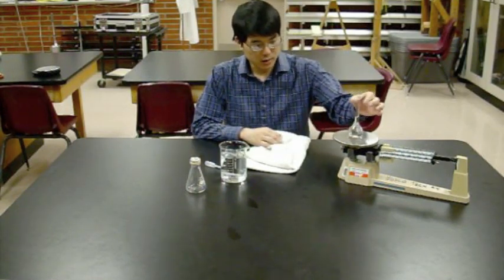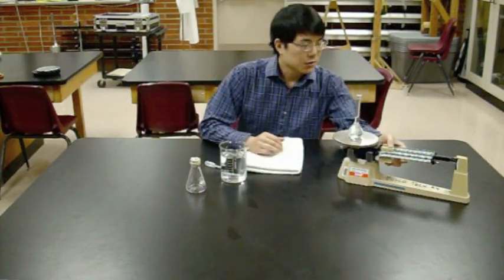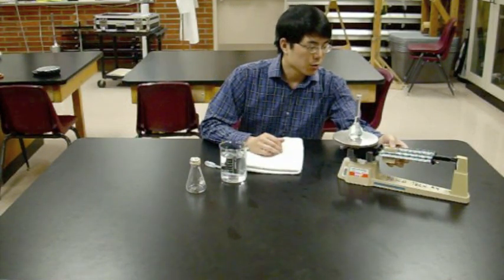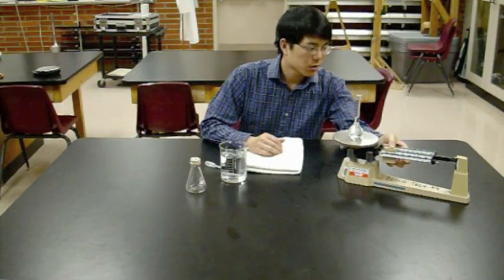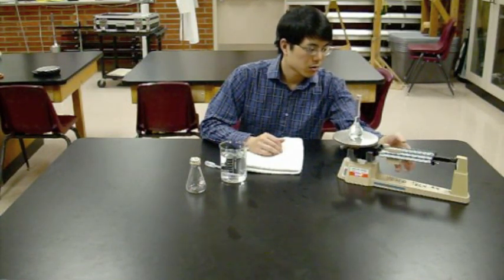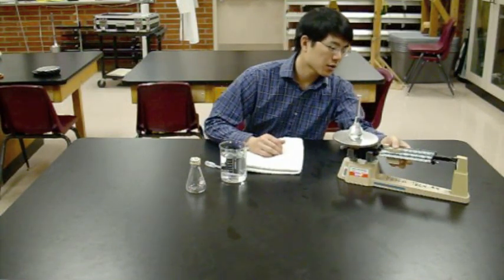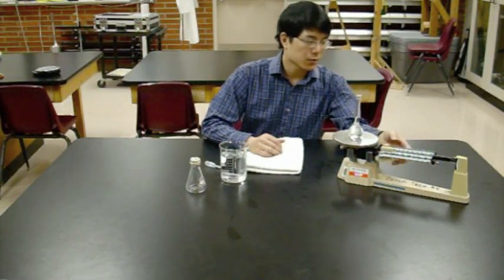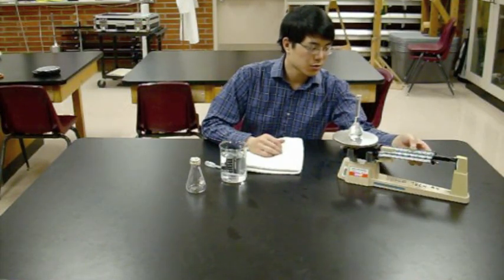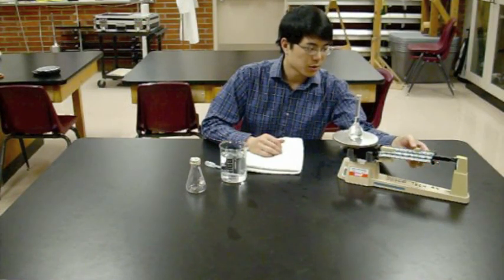And then put it back on the triple beam balance. Again, as always, start with the heaviest slider. It's still tipping the scales at the first notch on the heaviest slider. So let's try the medium slider.